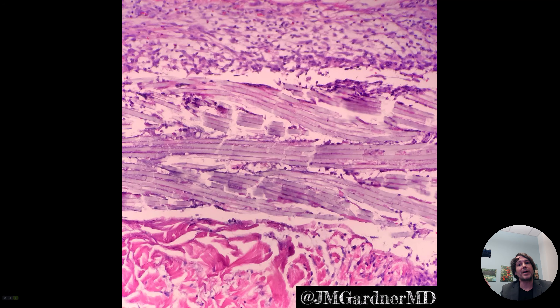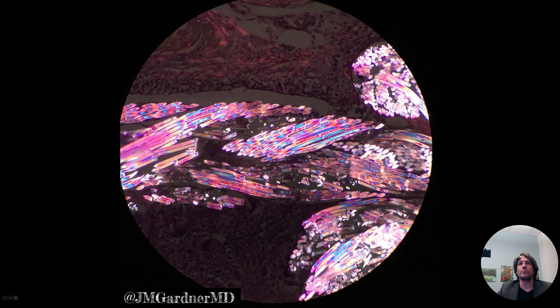But what's really cool is if you have a light microscope and you put in your polarizing filters — you have to put two of them in and turn the light up and then rotate — here's what suture looks like with polarization.